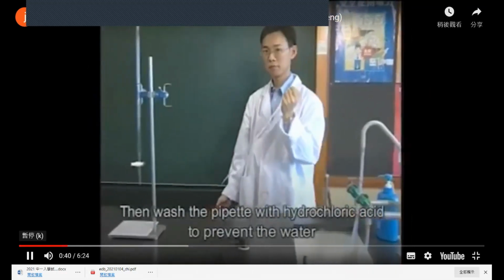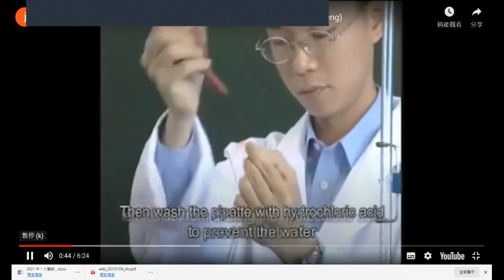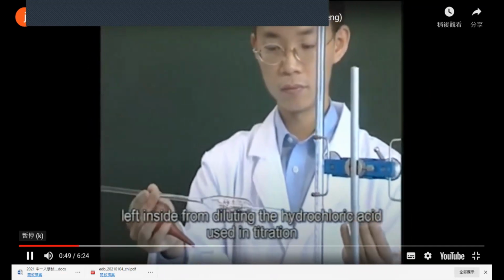Then wash the pipette with hydrochloric acid to prevent the water left inside from diluting it. This step is best: first wash with distilled water, then wash with the acid.